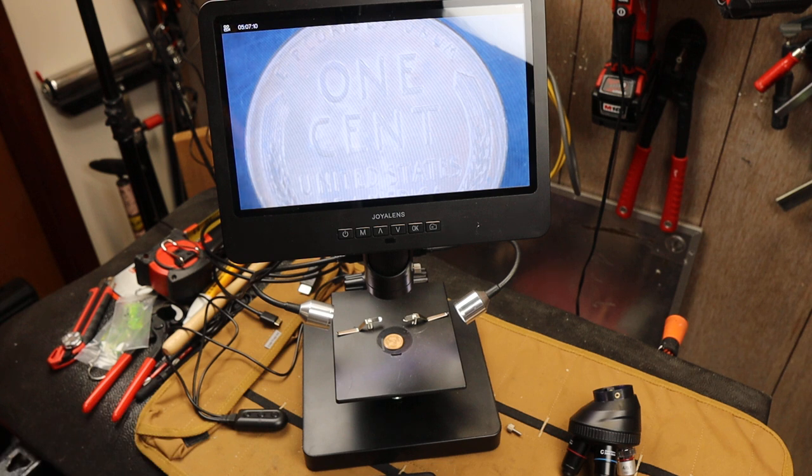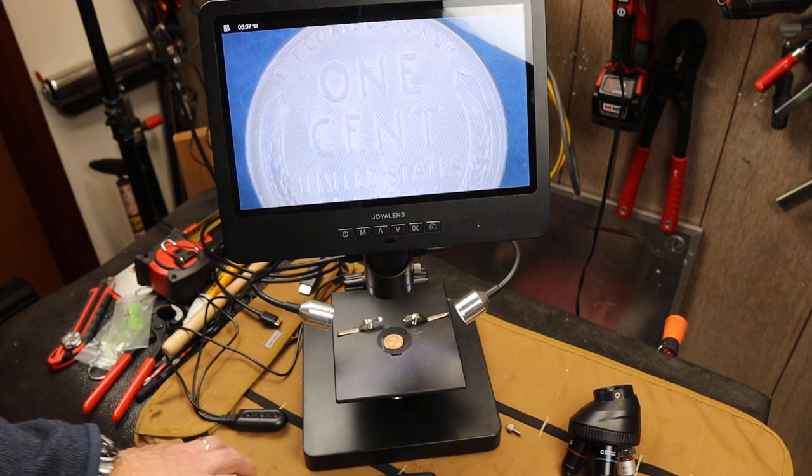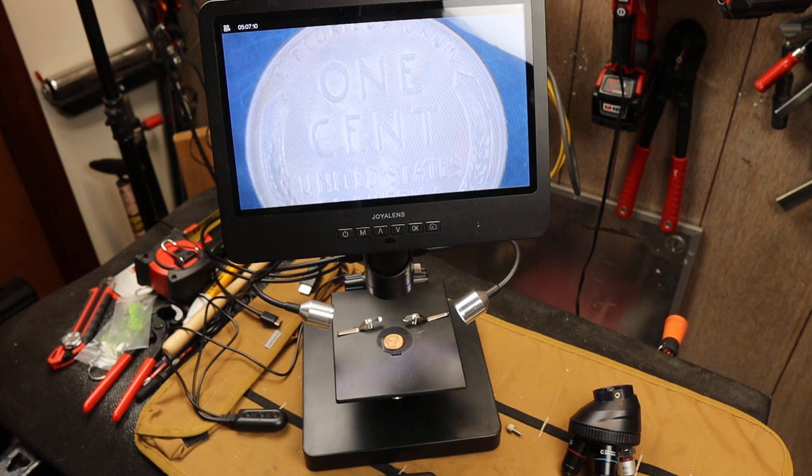Power supply is just standard 5 volt USB at 2 amp or higher, which is most things now, unless you've got older stuff.